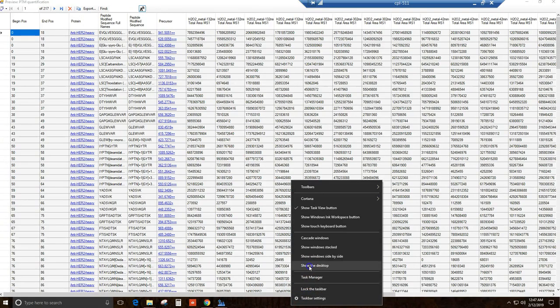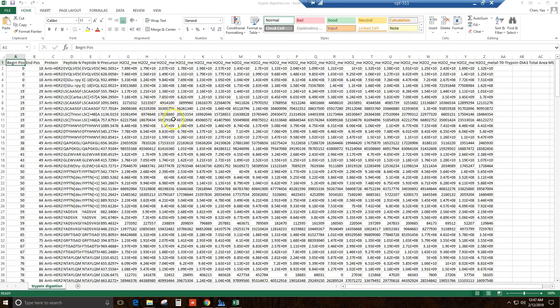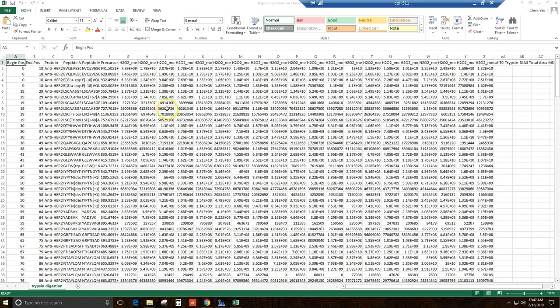We can scroll down and get all the data we need to process for global characterization. Remember, we have another chymotryptic digestion file containing a similar number of transitions. Before we import to the site, please do us a little favor. The sample names could vary drastically. Let us change the sample names to the sampling time points, 132 as 132 minutes. There are 4 scans per data point. Let us do it for the next 3 columns, and the same thing for the rest of the file.